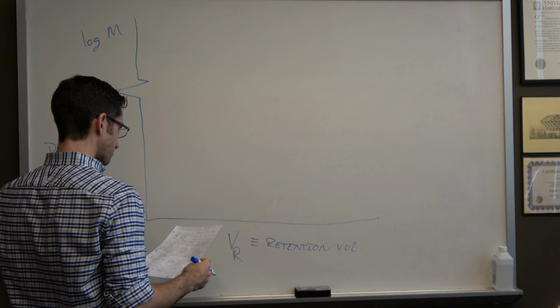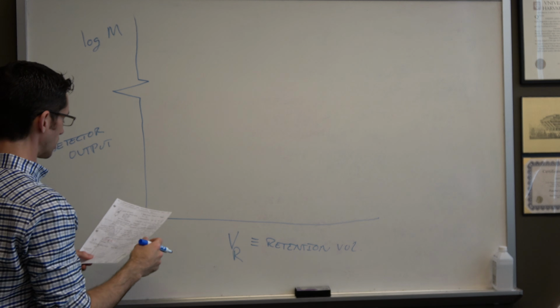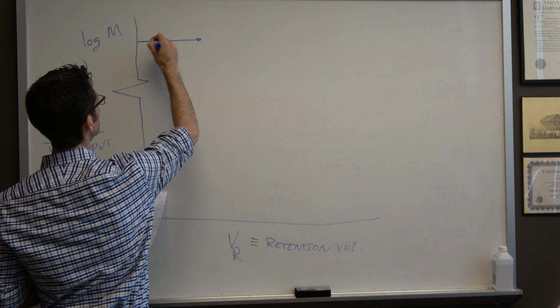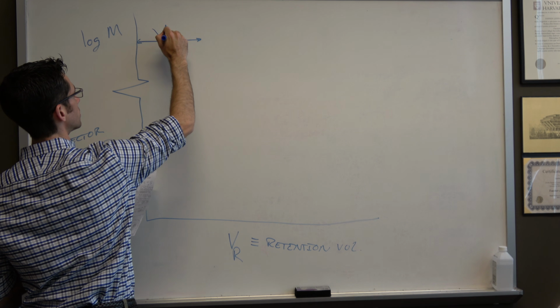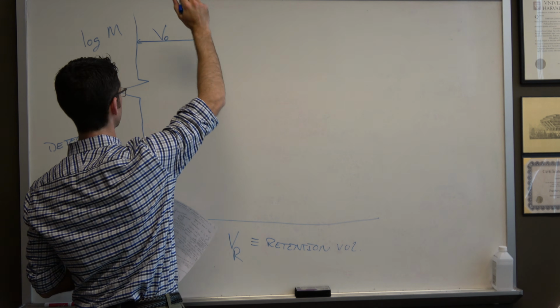So what we have at first for large molecular weights is some regime in which the polymers are completely excluded from the pores.